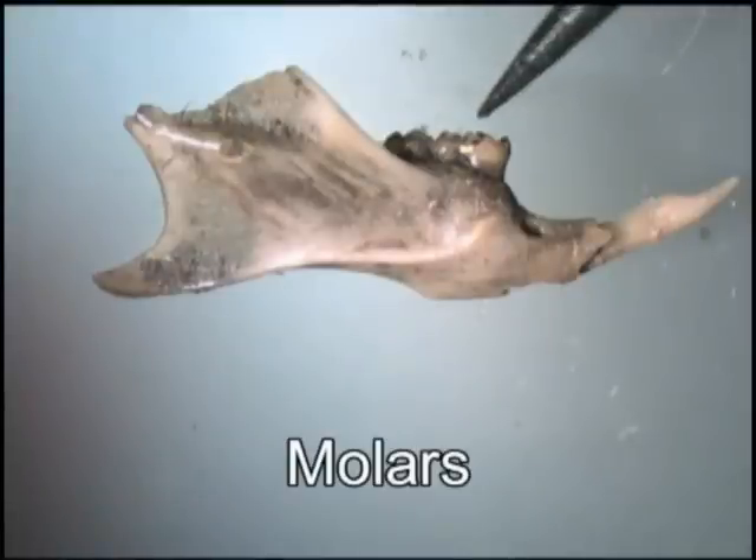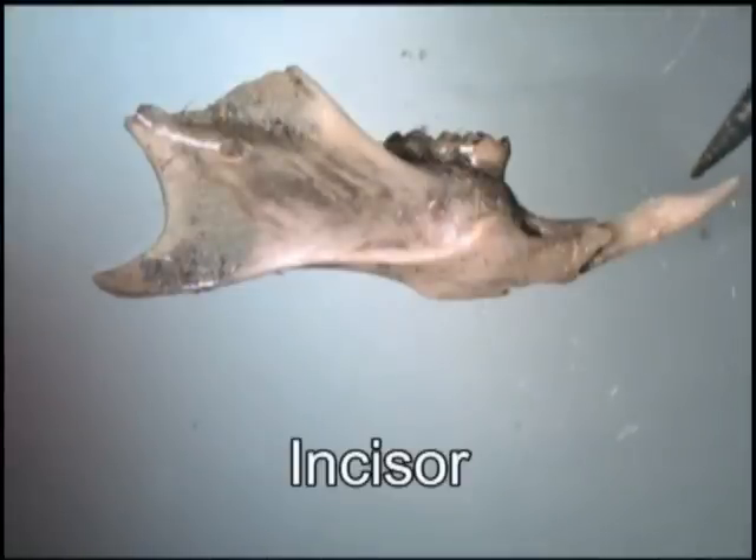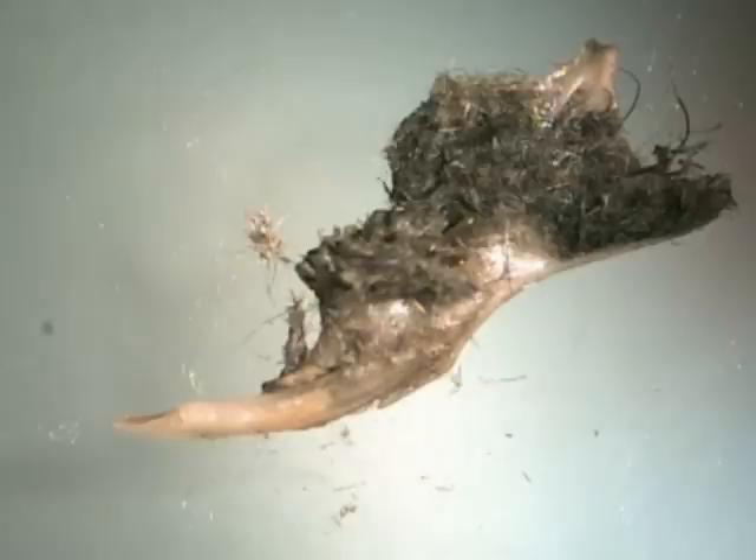Now we have cleared the bone of the fur, you can clearly see some identifying features — the teeth or molars and the distinctive incisor. Indeed, this piece is the jaw of a small rodent such as the introduced species, the house mouse.